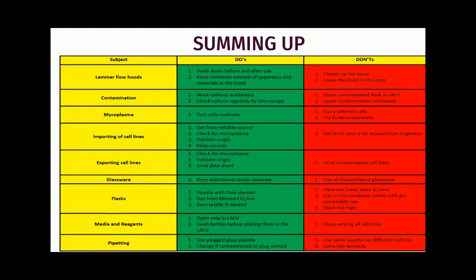Let's sum up the whole video with a table showing do's and don'ts for aseptic techniques. For laminar flow hoods, do's include: swab down before and after use, and keep a minimum amount of apparatus and materials in the hood. Don'ts include: do not clutter up the hood and do not leave the hood in a bad state.